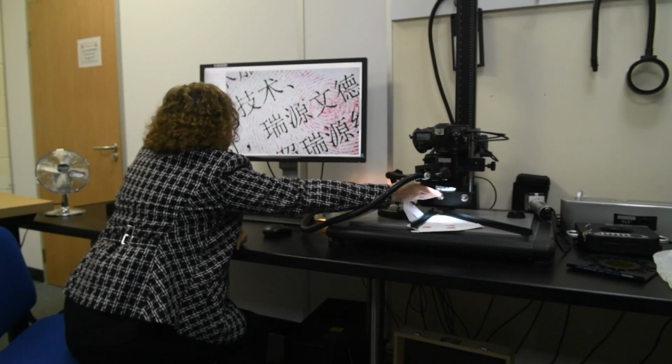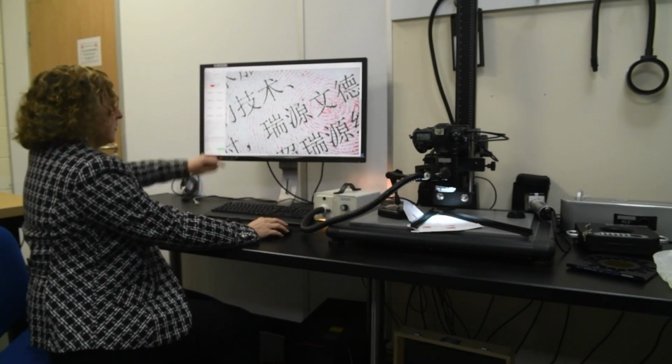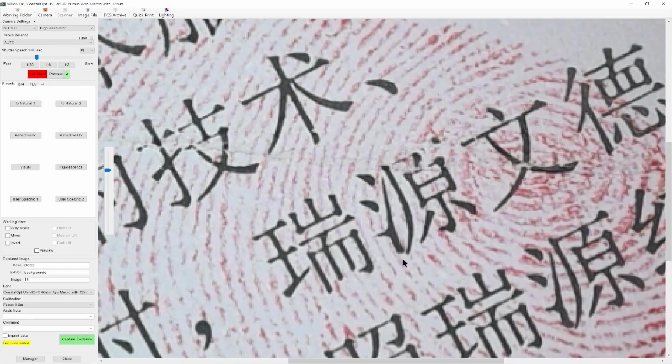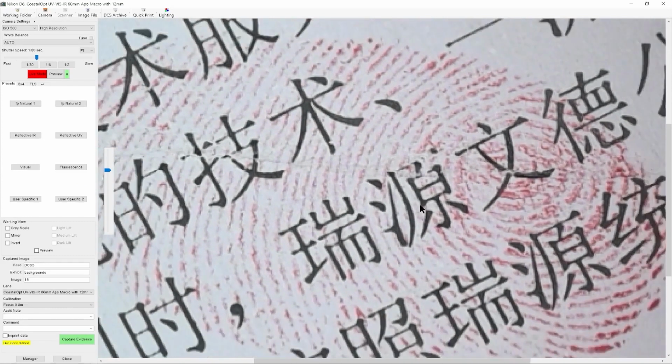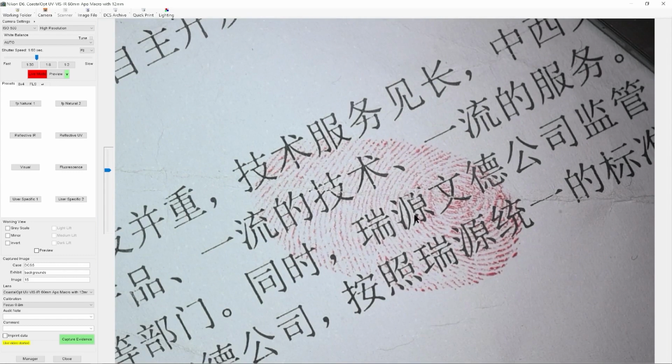But if we rotate the polarizing filter back to about there, we're now getting a mid-shade, or if you like, a value of 5 from the zone system of grey in our fingerprint image. So if we zoom this back to fill the screen, we're now seeing shades of grey.